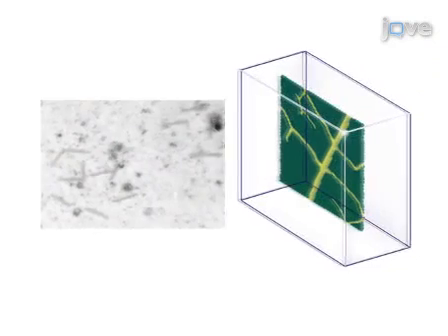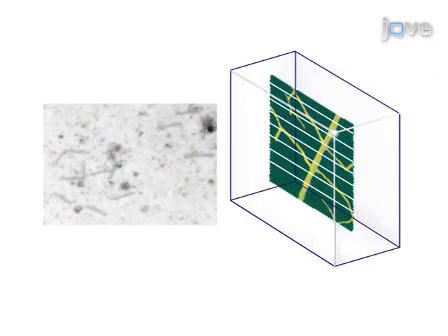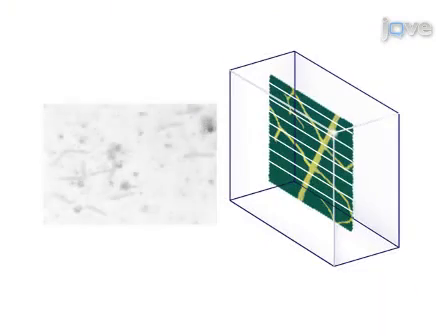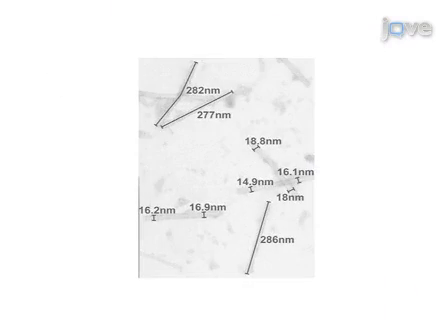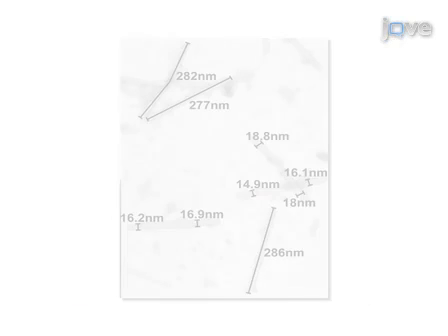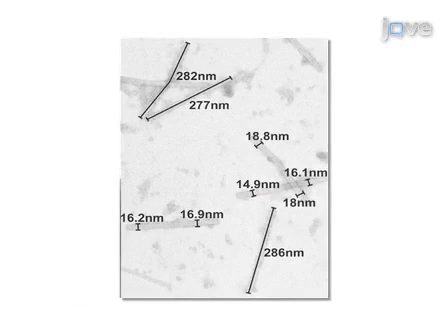Followed by sectioning of the embedded plant samples. The samples are then investigated in the transmission electron microscope, and the size of virus particles is measured by image analysis. Ultimately, the results show typical virus-induced ultrastructural alterations and the size of virus particles through transmission electron microscopy methods.